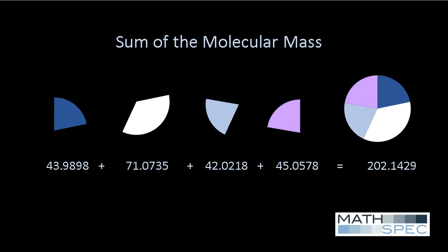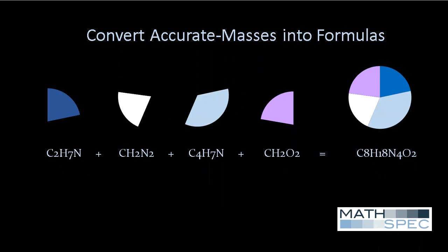The Excel add-in then checks these subfragment masses to find groups of masses that sum up to the mass of the whole compound. Usually there are over 1 million possible combinations of 3, 4, or 5 masses. The best combinations also sum up to the masses of the most intense fragment ions. In the next step, Excel converts each of these subfragment masses into possible formulas, which will then add up to the formula of the whole analyte.